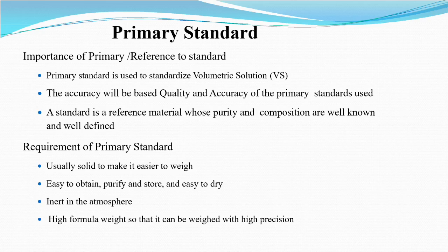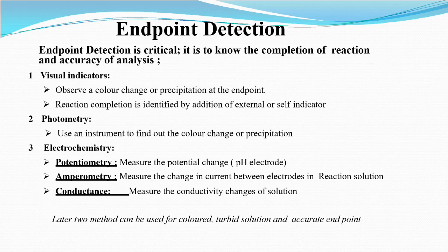For example, Mohr's salt: its molecular weight is very high, and due to that we can prepare it very accurately.